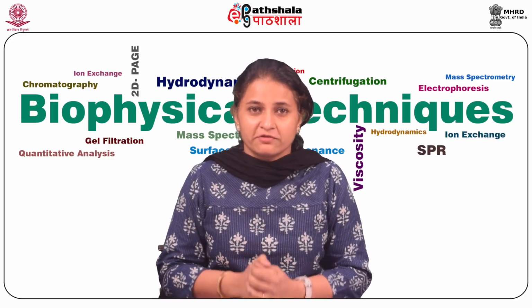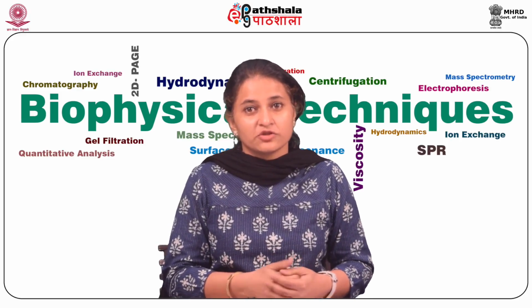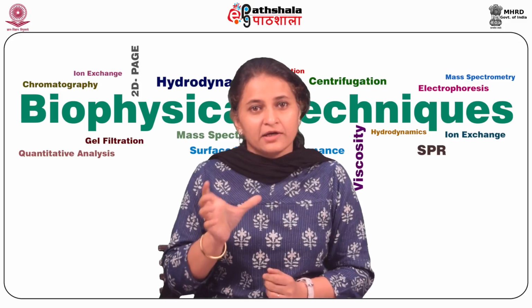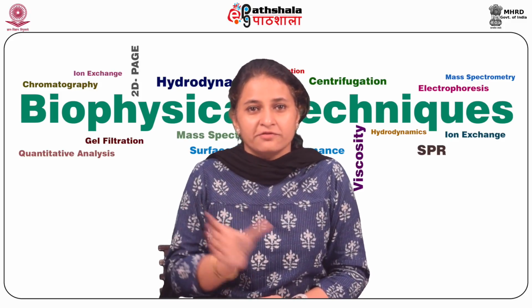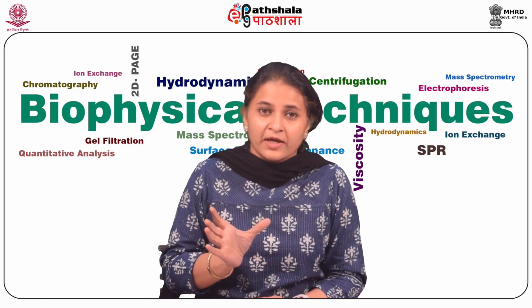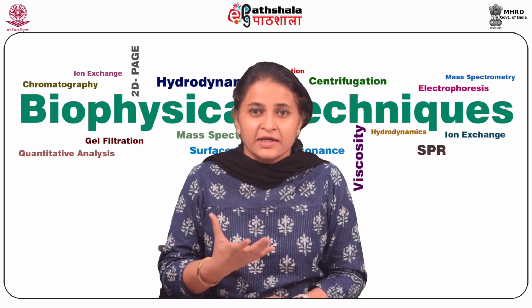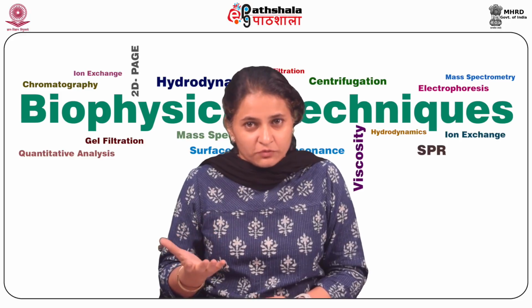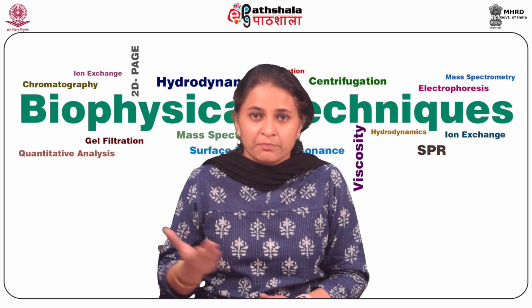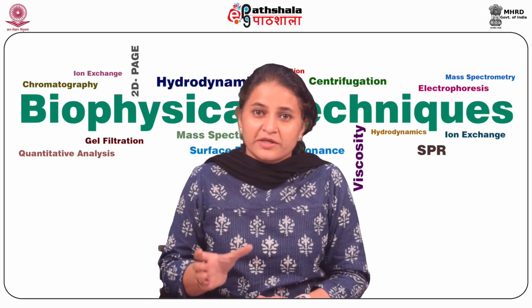However, this process of derivatization, which is called trans-esterification when converting them into methyl esters, converts them, as I said, into low molecular weight non-polar derivatives. The good thing about it is that very small amounts of material are required, and in this process the lipids in the sample are first hydrolyzed and then trans-esterification, which is basically an ester exchange process using compounds like boron trifluoride, etc., converts them into the respective methyl esters.